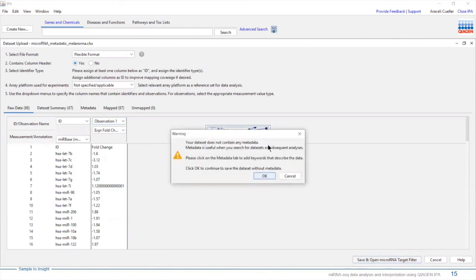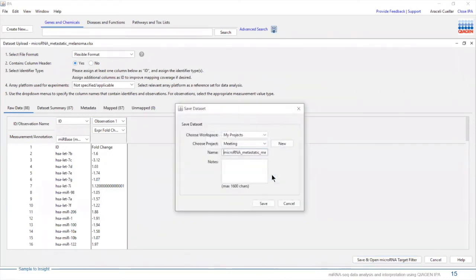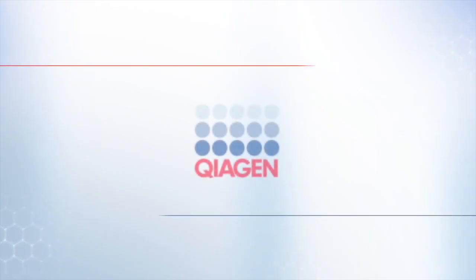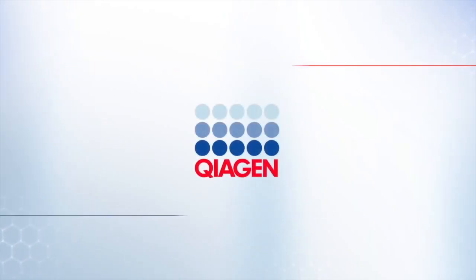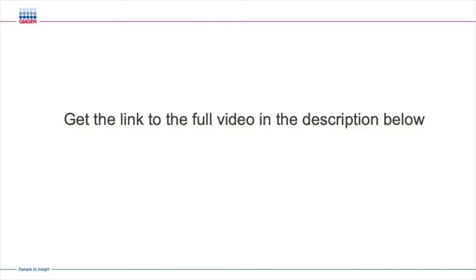This warning is letting you know that you don't have any metadata associated with the dataset. In this case, that's OK. I'm going to go ahead and click OK and save it to my folder.